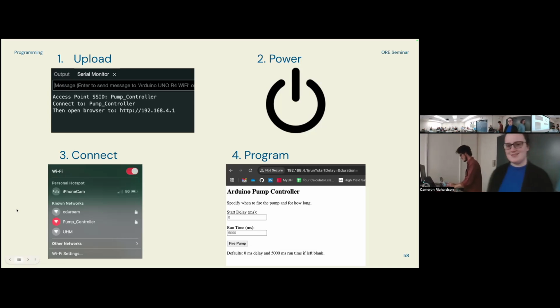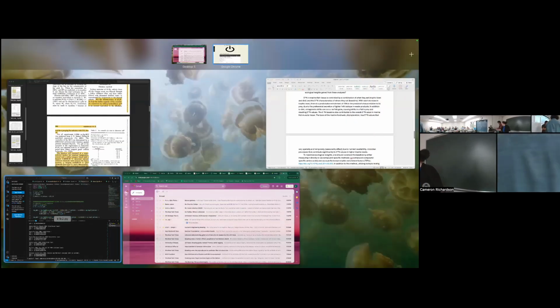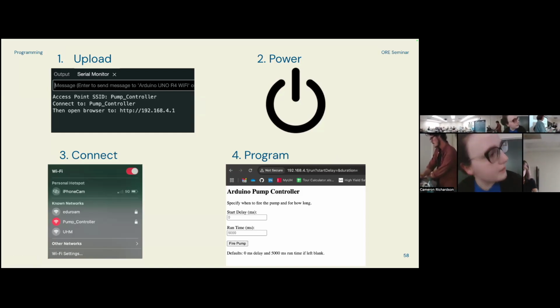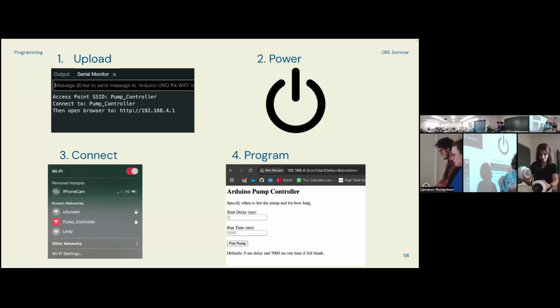All right, okay, we got our auto sampler right here with the brain right here, and then this is the sampling unit with the filter and the sampling bag. So thank you, Mike, for all the equipment that we stole from the lab.